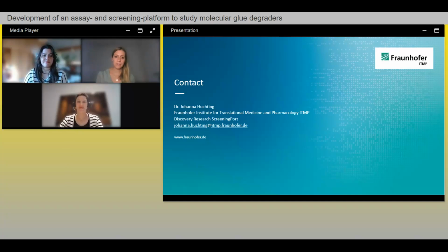Yeah, I agree to everything you said, Johanna. Thank you for that. And just something out of the lab that we usually do, if we have the liquid handling established, one cross-check before we go live with the screening is a plate uniformity, just high, medium, low controls all over the plates in different variations. And then you will see how well your liquid handling is also working. So that's one thing we also usually do. And also, just for robustness, we usually calculate all the parameters such as Z prime, CV% that are out there.